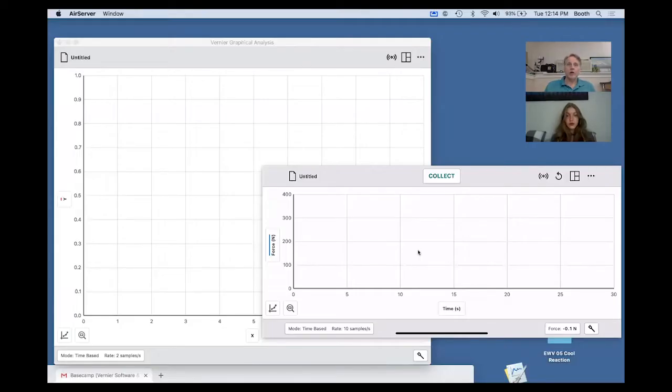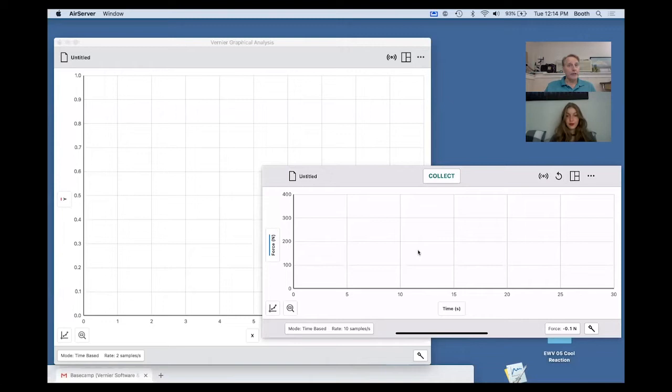Hi, I'm David Carter, STEM Training Director for Vernier Software Technology, and I would like to show you a new feature in our Graphical Analysis Pro software.